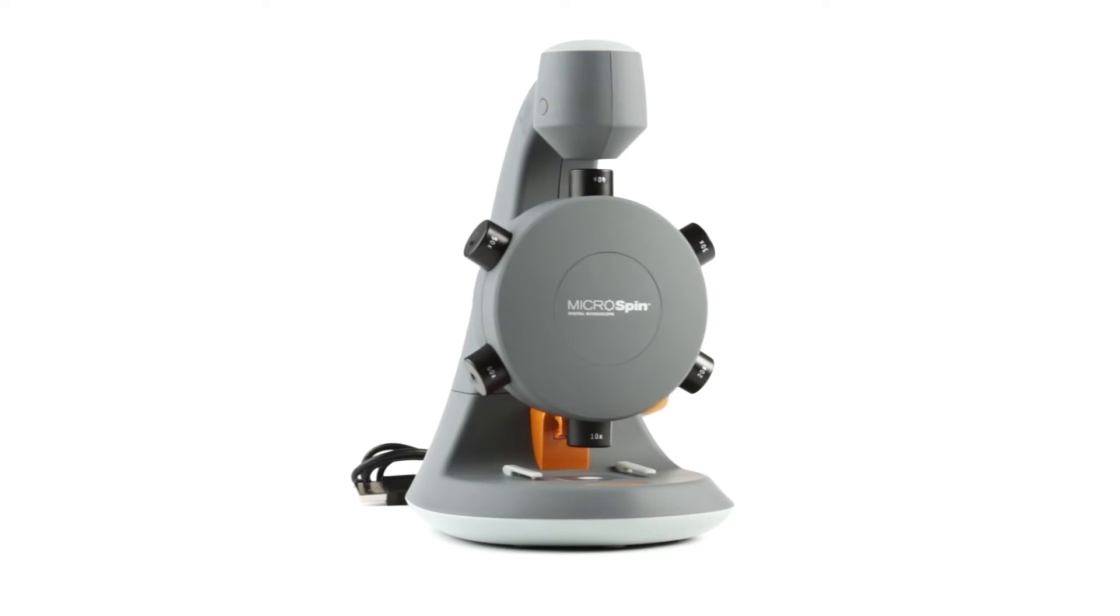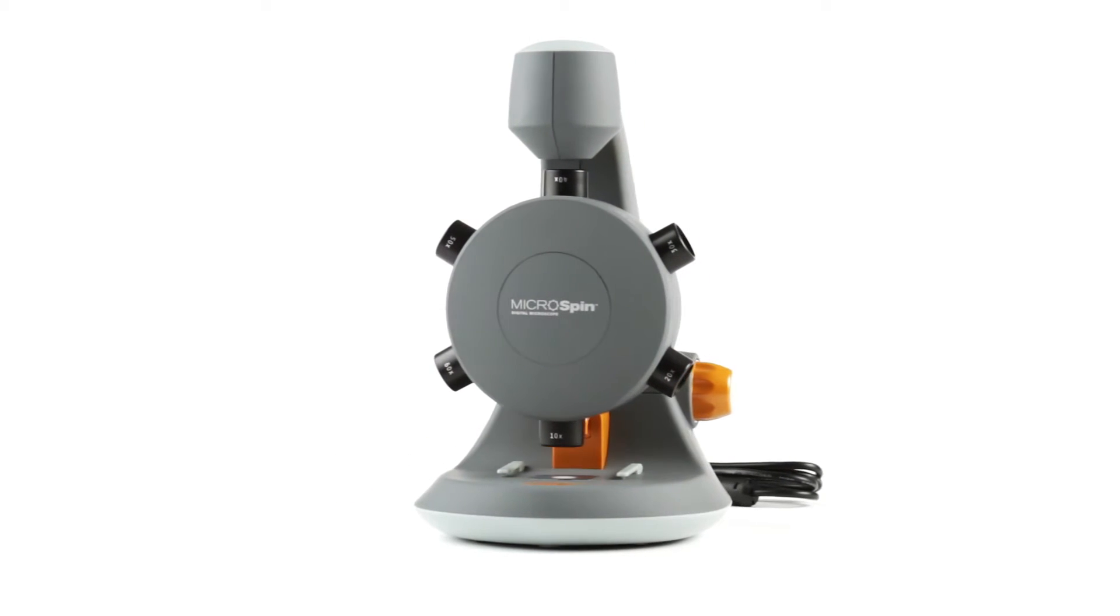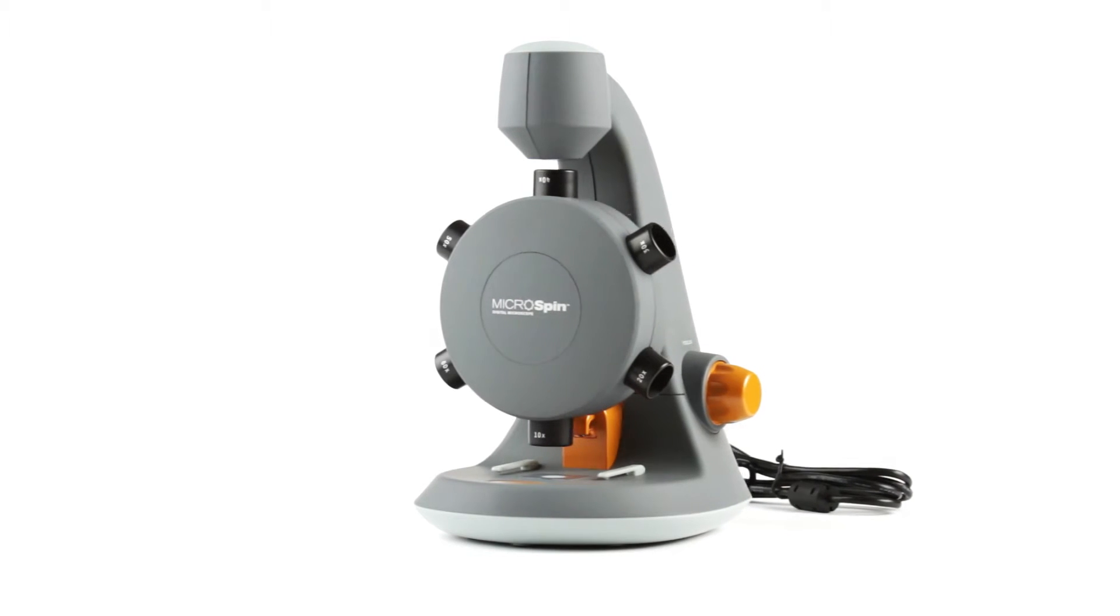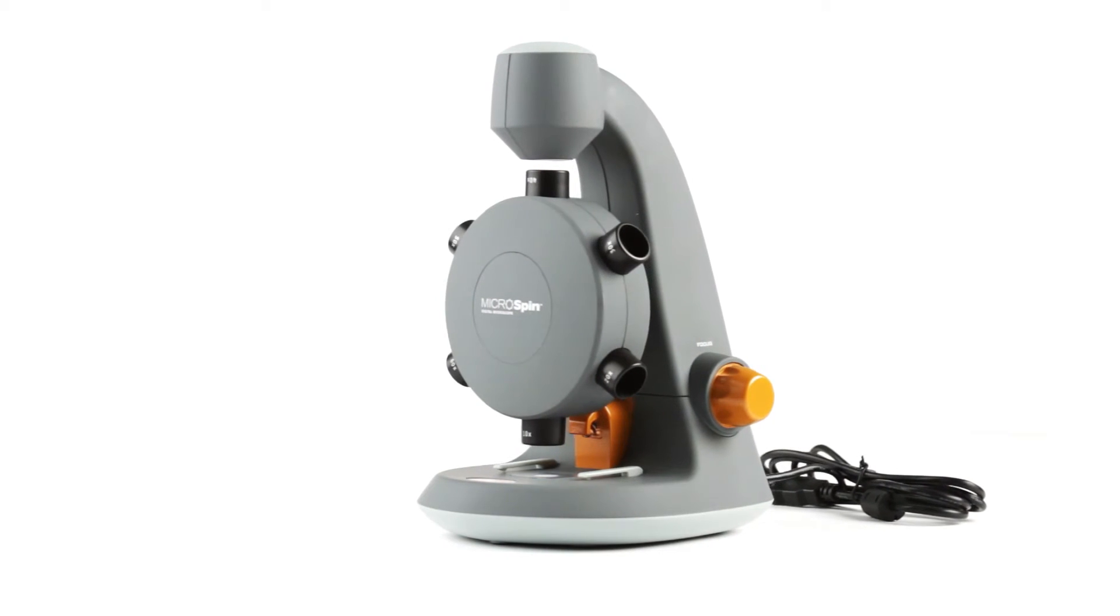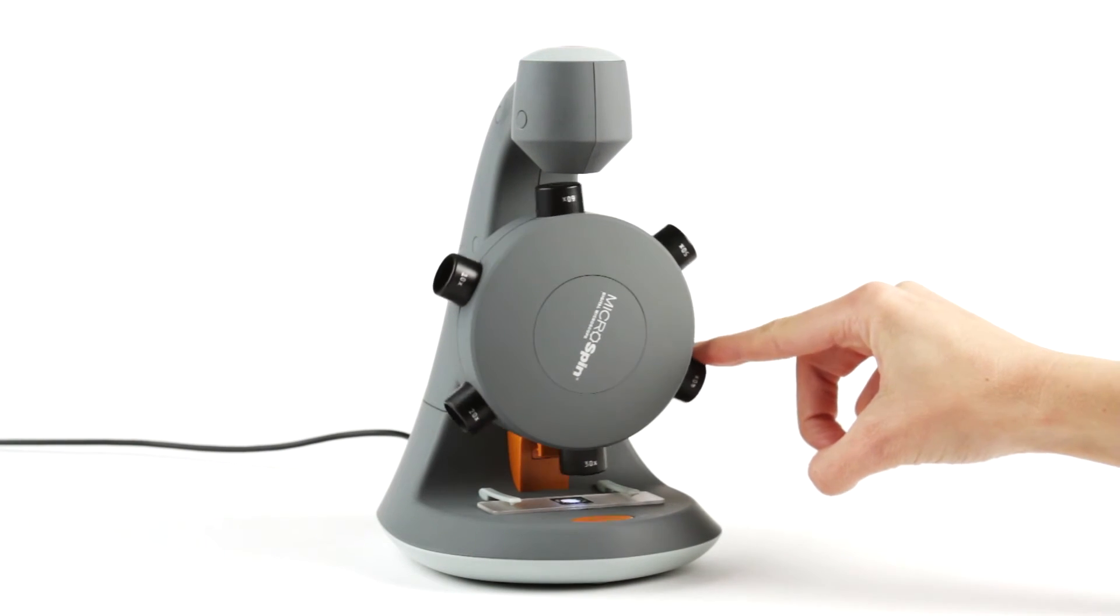Spin, snap, save and share. The Celestron Microspin Digital Microscope features six objective lenses ranging from 10 times to 60 times on a rotating wheel. Spin the wheel until the desired lens clicks into place.